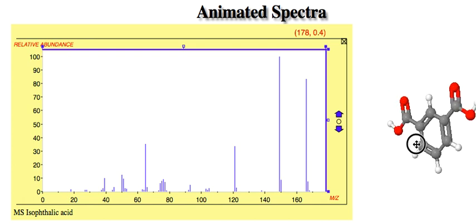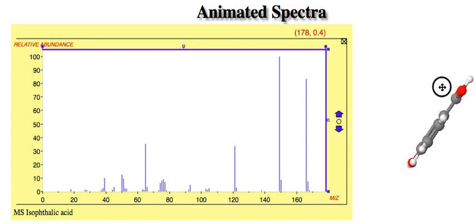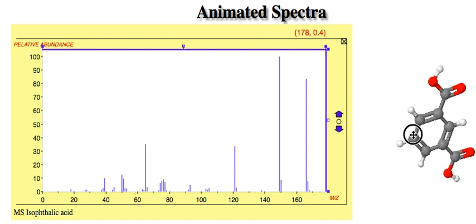Okay, I pushed my window too far over. This molecule here, now we're on screen, is called isophthalic acid, and it's got all kinds of stuff going on here. The most important thing that's going on here is that we have this peak here, which is at 166. And I wanted you to notice that over here, we have the short little carbon peak that we talked about on the other video coming in.